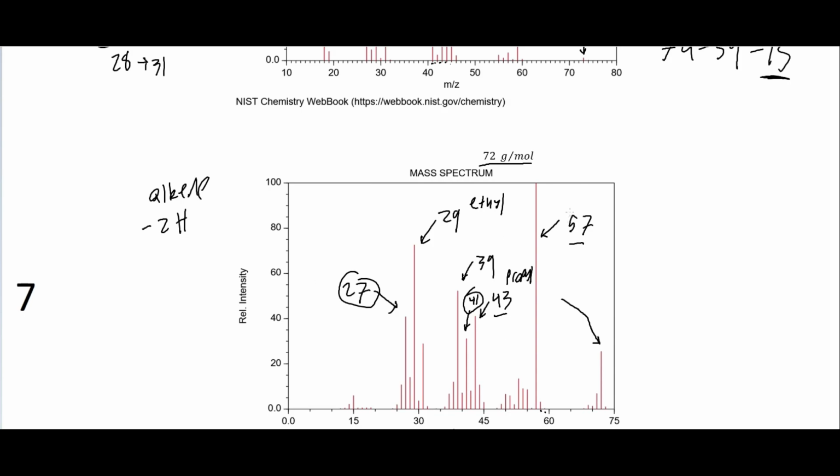But one thing that can actually account for that is, if we have our double bond, which is minus 2 hydrogens, and if we have an oxygen, that gives us plus 4 because of the oxygen, which is 16 as opposed to the 12 from carbon. But then it also has 2 fewer hydrogens, so that would be 2 minus 2H from that compared to just an alkane.